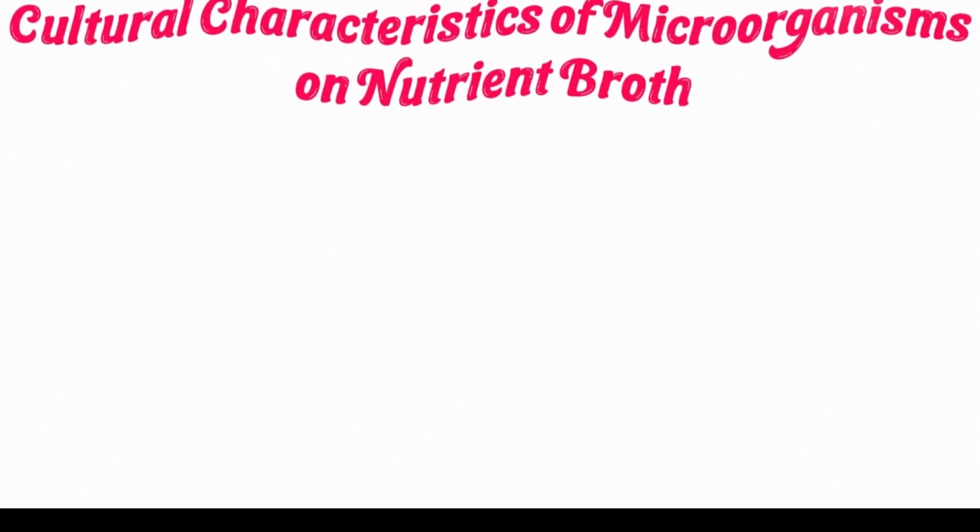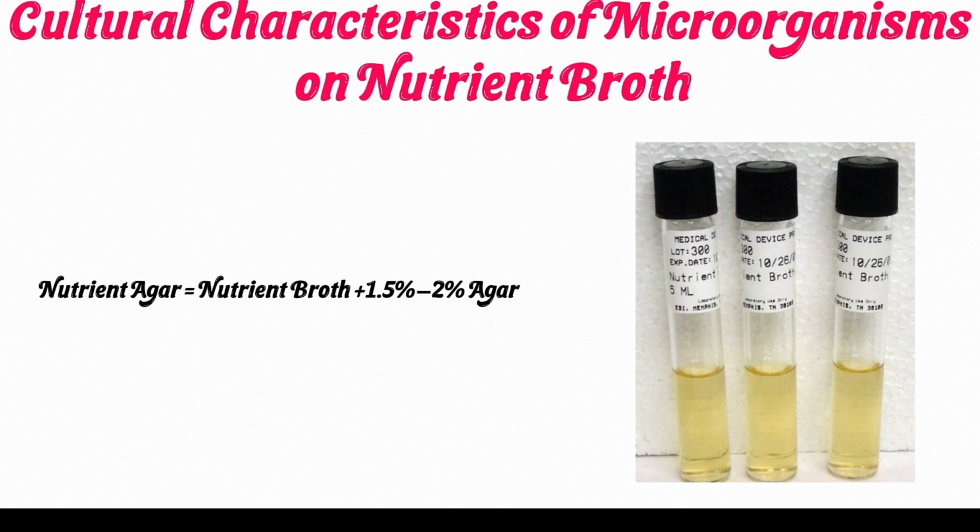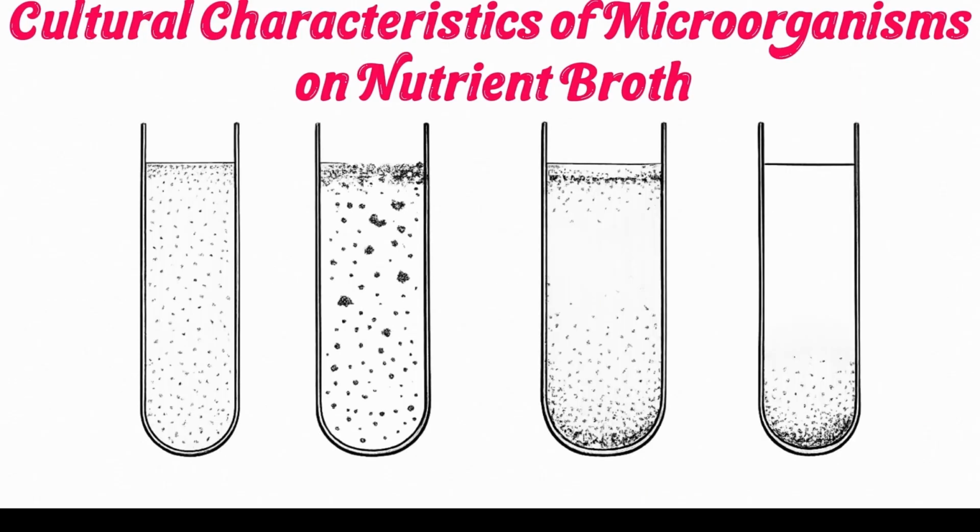Now observe cultural characteristics on nutrient broth. Nutrient broth is a liquid medium. Since there is no solid surface, bacteria cannot form colonies. Instead, we observe how they distribute themselves throughout the liquid, and following characteristics can be observed.